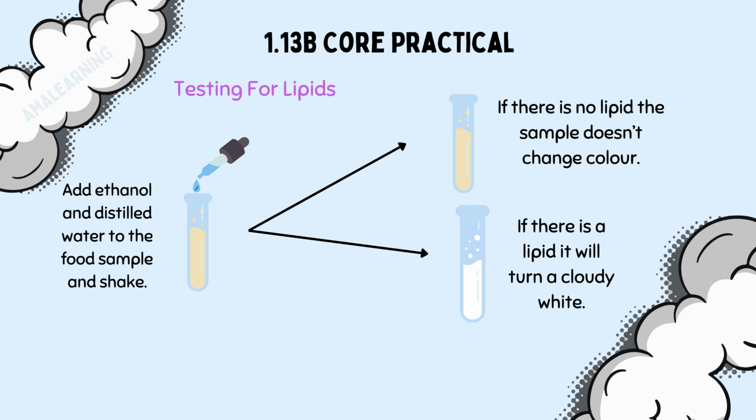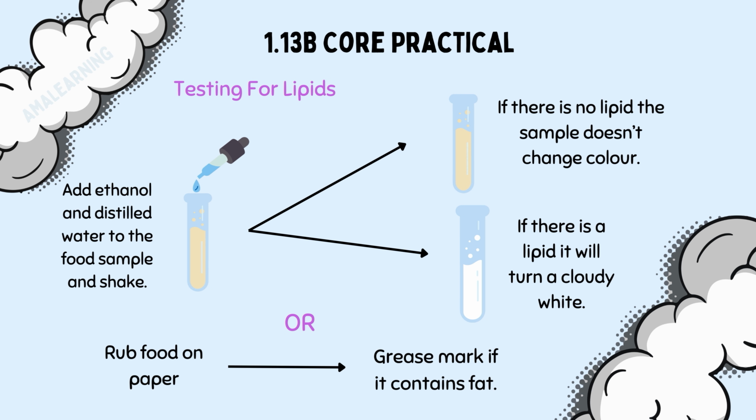In addition to the method just mentioned, you can also rub the food sample on a piece of paper. If it does contain lipids or fat, it will leave a grease mark.